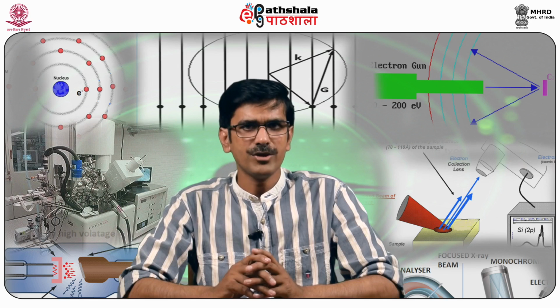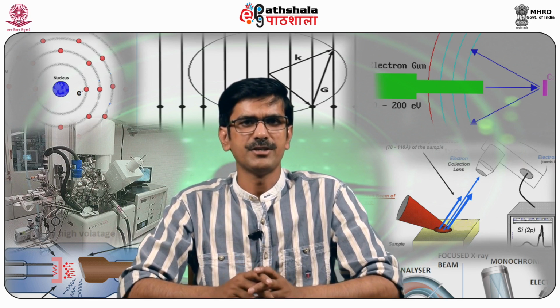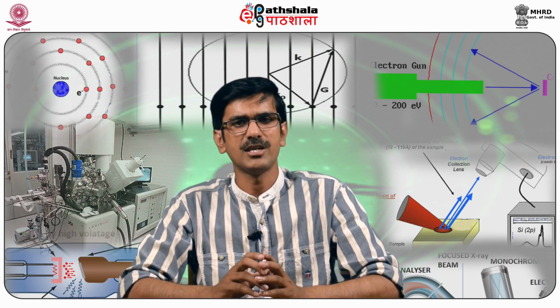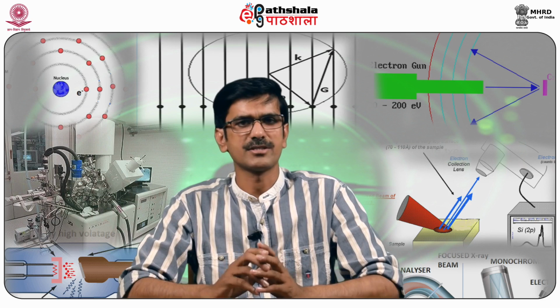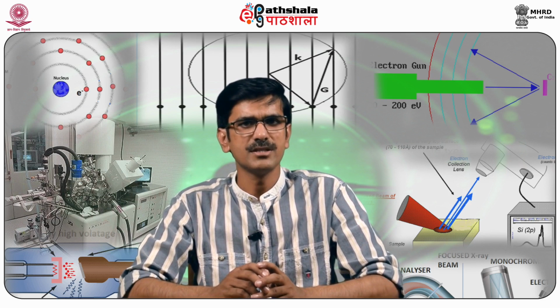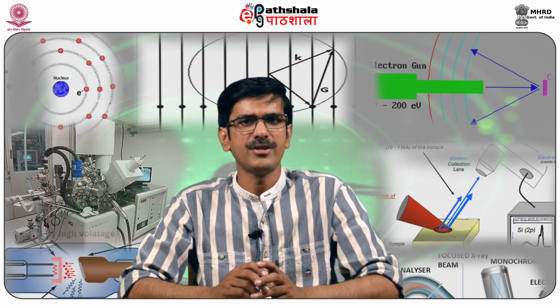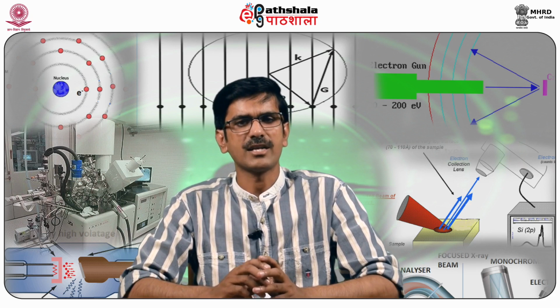Elements with atomic number from beryllium to uranium can be detected. The variation of detection limit depends on the element and the sample matrix. If there are a large number of elements, the peaks that are obtained are overlapping peaks and they are identified depending on their peaks in the different X-ray families.